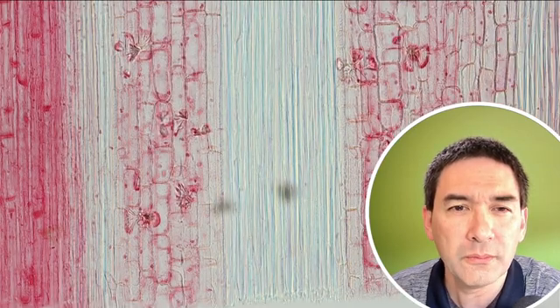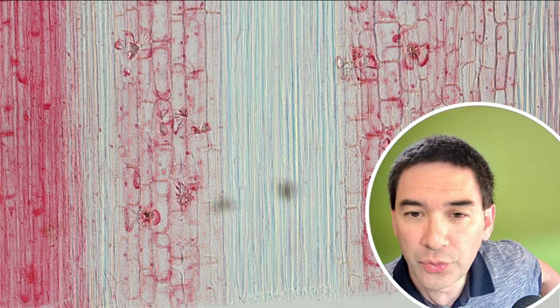This is now the antique slide under the microscope. The cell walls are stained red because of the carmine. As I scan across the slide we're able to see some kind of alternation between different cell types — some regions are stained quite red, and then we have regions with less color. We've also got regions where the cells seem to be extremely long and thin, running in parallel. Those regions are where the sunflower stem transports substances up and down the stem.